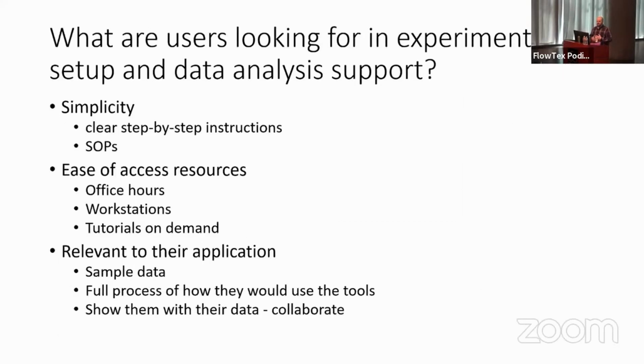And so I boil this down to what I think my users are looking for in experimental setup and data analysis support. The first thing is simplicity. Clear step-by-step instructions and SOPs. A lot of the time you'll go to a meeting, you'll see a great talk, it'll walk you through a tool or show you a tool, show you the outputs, but it doesn't show you all the steps, and they have beautiful sample data like the OMIP 69 data, right? But people really like these little step-by-step instruction vignettes.